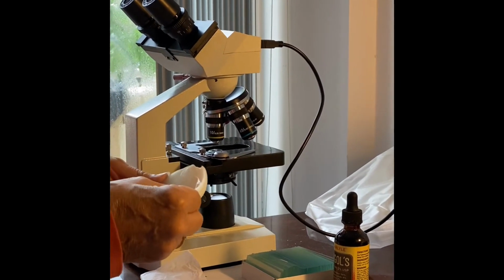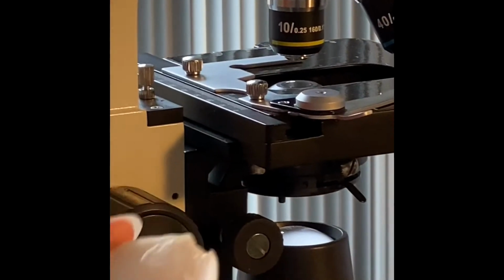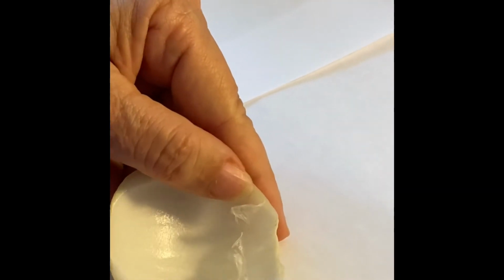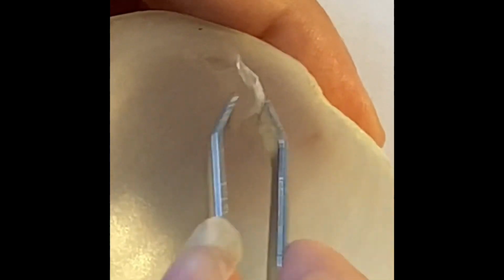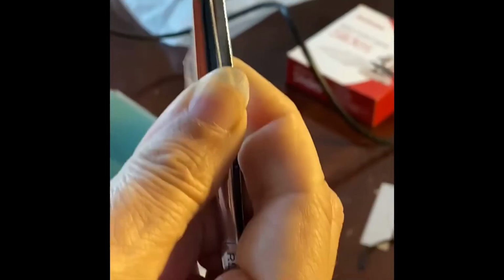As you can see, this one was cut in half, and there is a membrane. The membrane's right there, and you just take your forceps and pull out the membrane, but you need to flatten it.